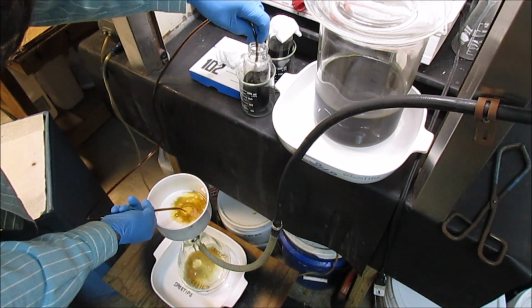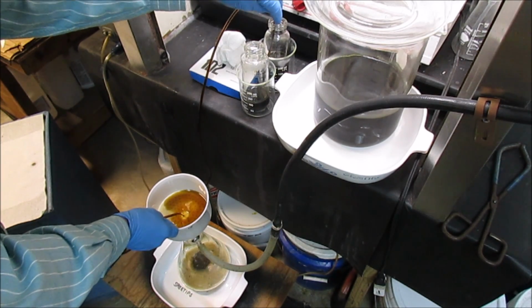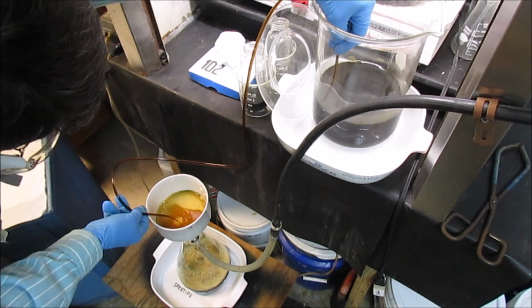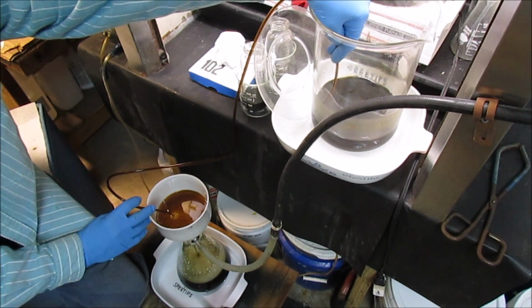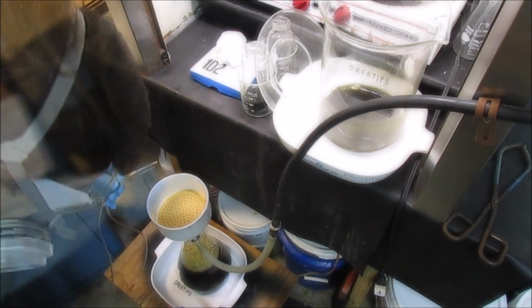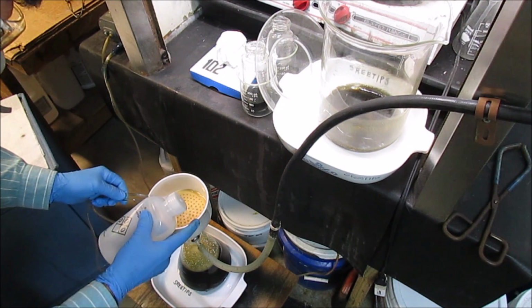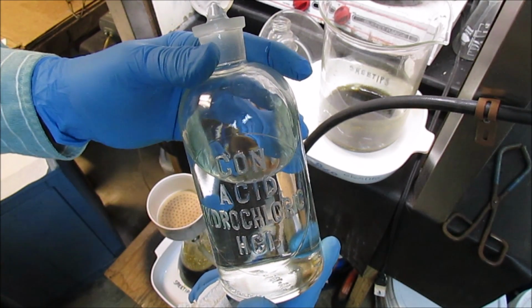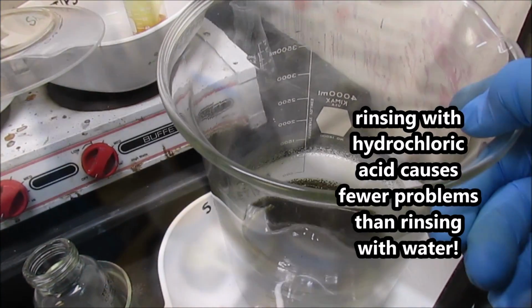As before, I chose to siphon these solutions off rather than pouring them into the filter. The filtrate in that flask will be my platinum group metals, and rather than pouring the solution through the filter and risk getting some of the gold sediment down into that filter and having it pass through and contaminate my PGM solution, I wanted to try to avoid that. Here I'm just rinsing out the siphon tube with some distilled water. Now I choose to rinse the filter with some hydrochloric acid instead of water. Water seems to cause problems when you mix it with these PGM solutions.